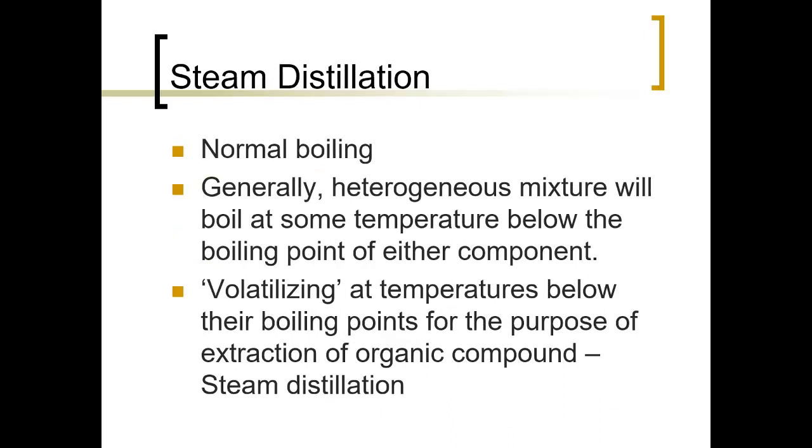And so you're just going to be boiling just like you learn in Gen Chem, water boils at 100 degrees. So when we do steam distillation, it may actually cause your boiling point to be changed slightly, but not dramatically. The majority of what's going to come off is water, and that's why you have so much water in comparison to clove oil.